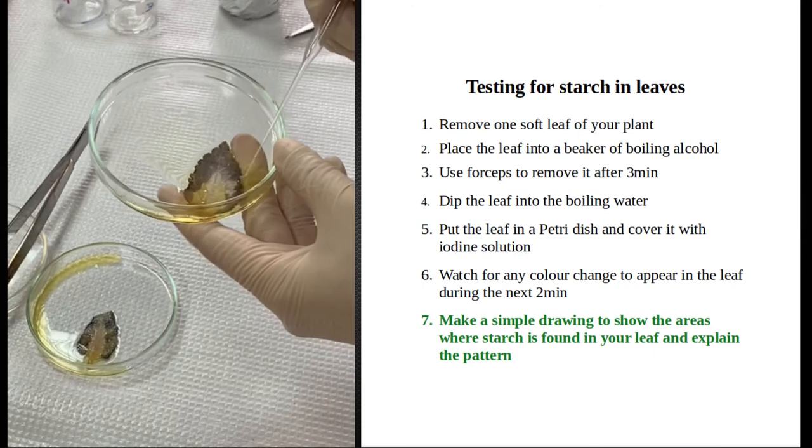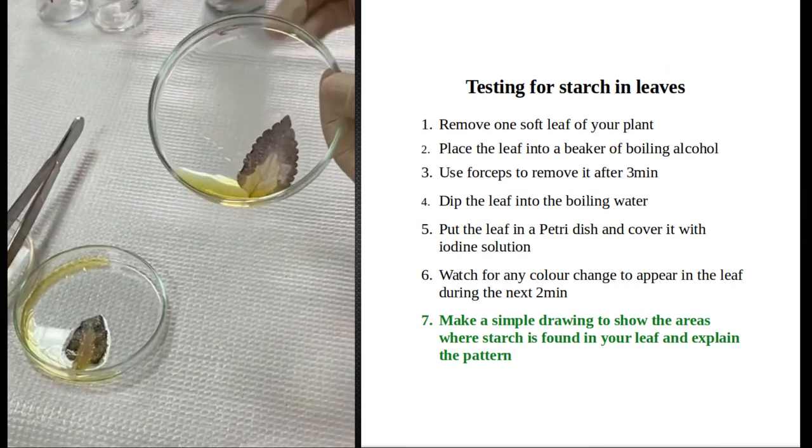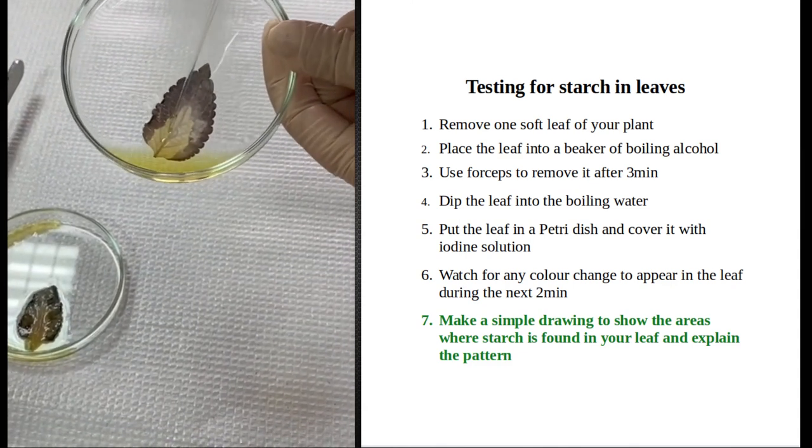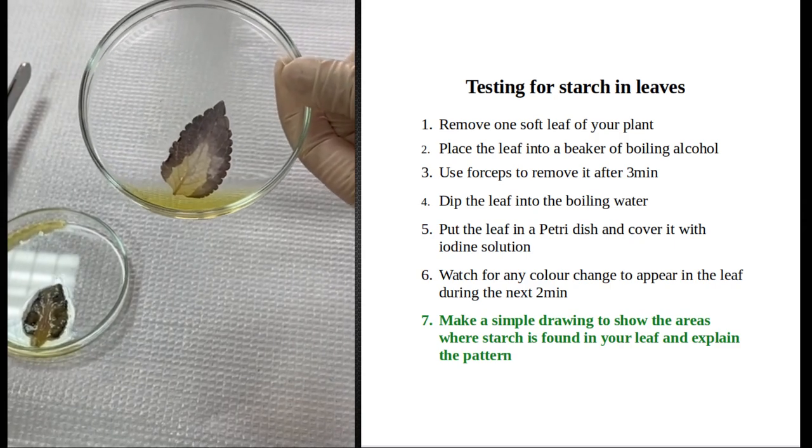Green areas are now dark blue in color, indicating the presence of starch, while the middle where we lack chlorophyll, photosynthesis did not take place.